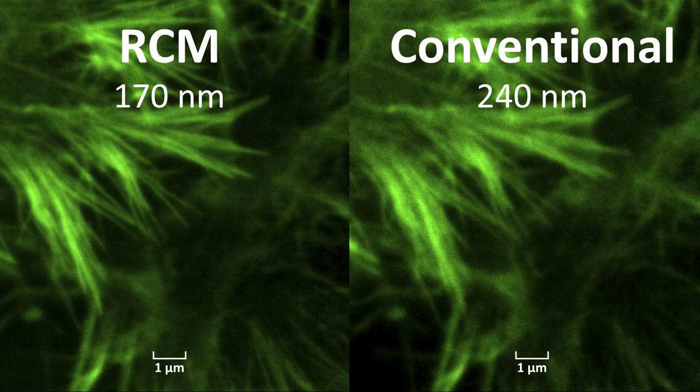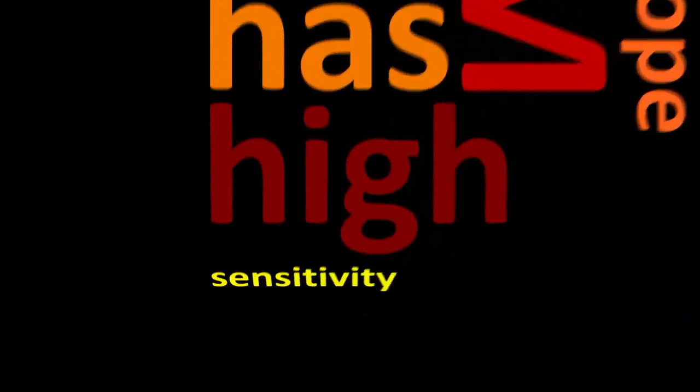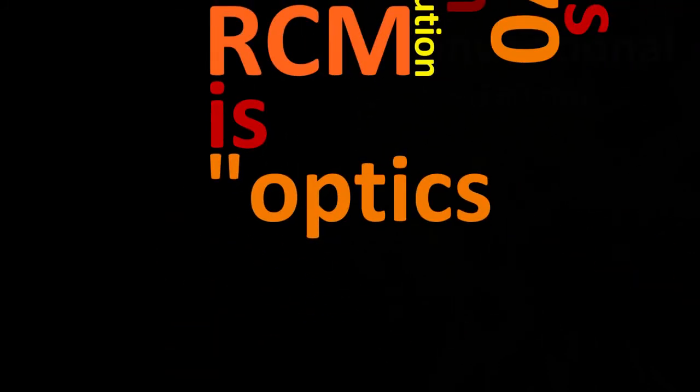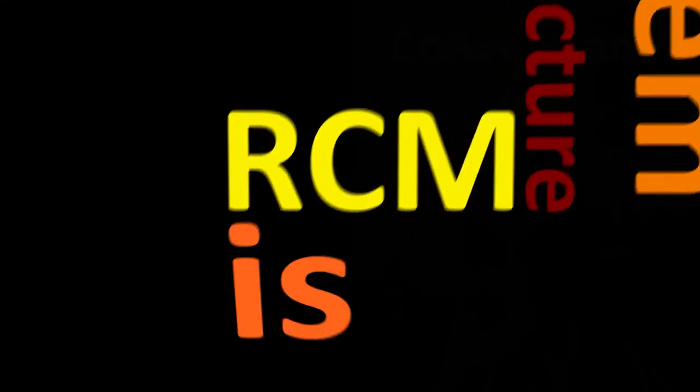In conclusion, RCM is a confocal microscope. RCM has high sensitivity. RCM has 170 nanometer resolution. RCM is optics only. RCM is affordable. RCM has a fully open system architecture. RCM is designed by scientists for scientists.